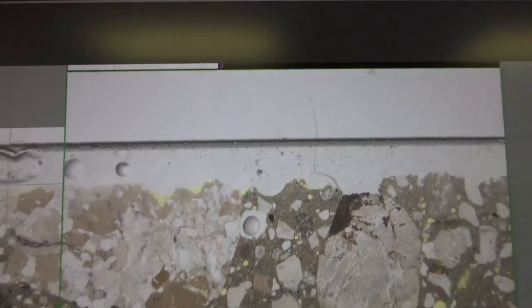That's the horizontal bar. Now if I stop at one point and play with the coarse focus, you see if I go out of focus or in focus. When I go out of focus, you see the focus bar going down, and when I come back to focus, the horizontal bar gets longer.